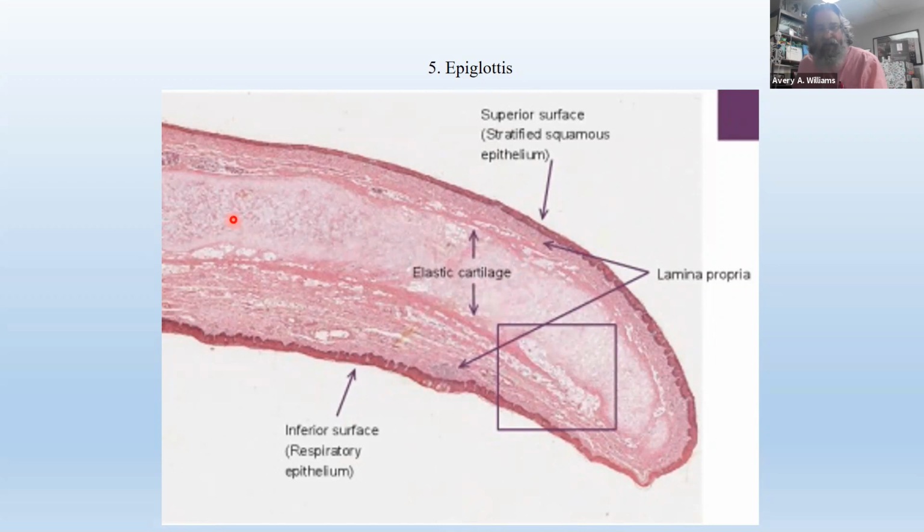Now here is the skeletal element. A lot of times when you think skeletal, you think bones. You say, that's a skeleton. Well, no, it's cartilage. But what a skeleton is, by definition, it provides structural support inside. So it gives it a form. Like your ear, remember your pinna or your auricle. Humans have an auricle, they don't have a pinna. It has a shape. It has to have some kind of structural component inside of it to give it its shape, and that's the cartilage, the elastic cartilage.